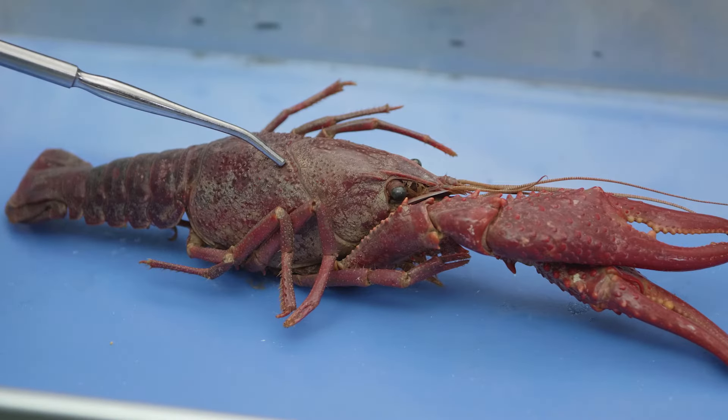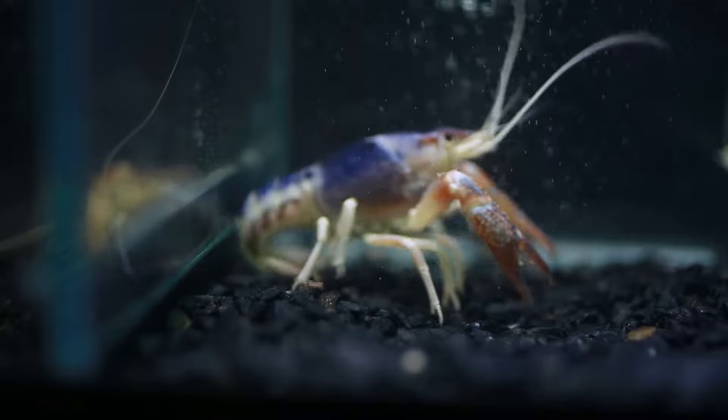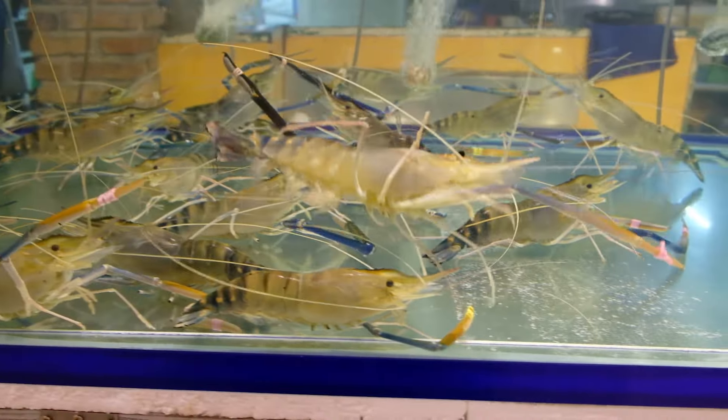The exoskeleton of the crayfish we are dissecting has a reddish-brown color, but crayfish may be black, brown, blue, white, or other colors.